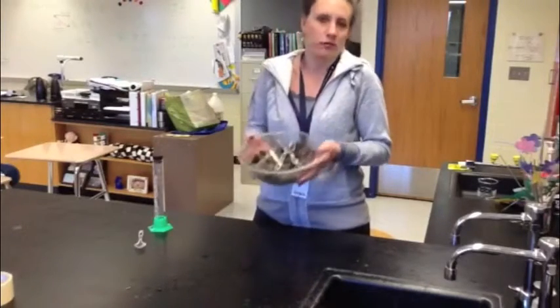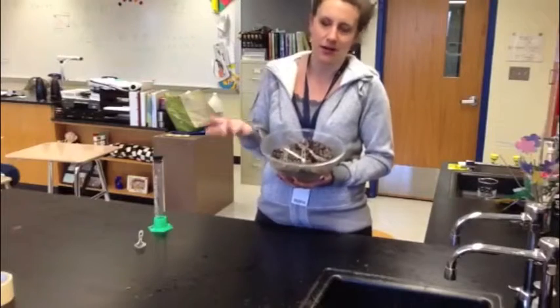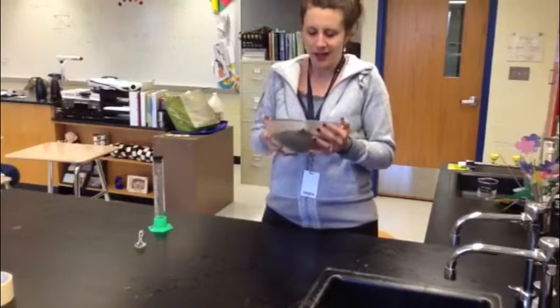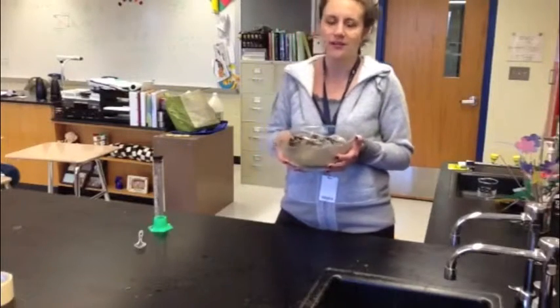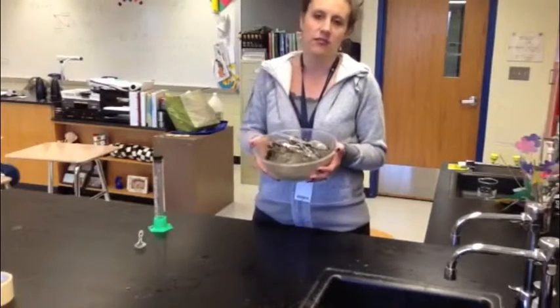Here I have some soil — I just got it from outside, obviously not right now because it's a little cold out, but I did get it from outside. And all we're going to do is just take a look at this and try to see what the texture of this soil is.